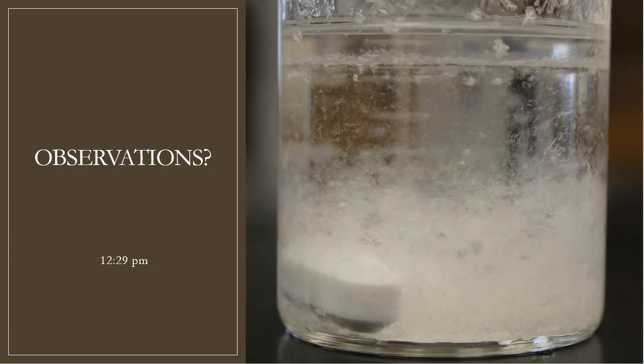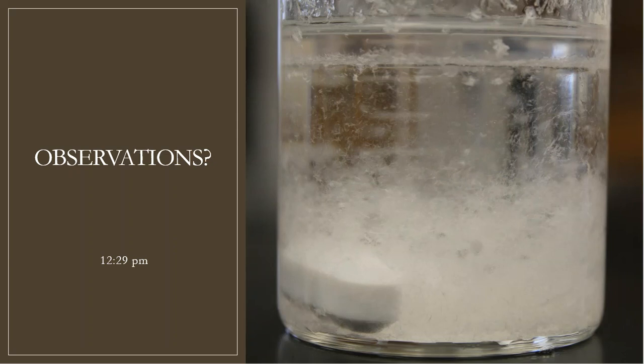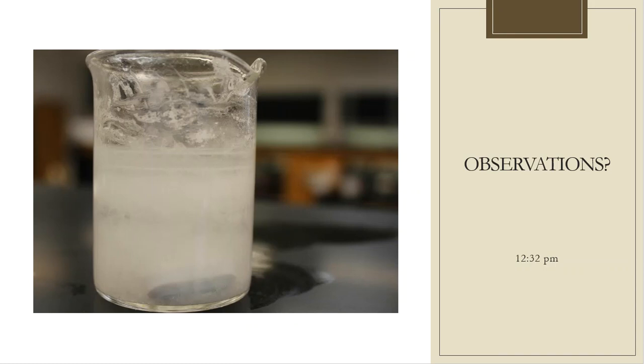All right, so at 12:29, here's an observation. It's beginning to change. I start to see more and more solid, don't I? Here's the picture at 12:26, and then 3 minutes later, this is what I end up seeing. And then 12:32, a little bit later, this is what I end up seeing. So once more, you can make your observational changes as you see fit. Write those down into your lab notebook so that way you get credit for those.